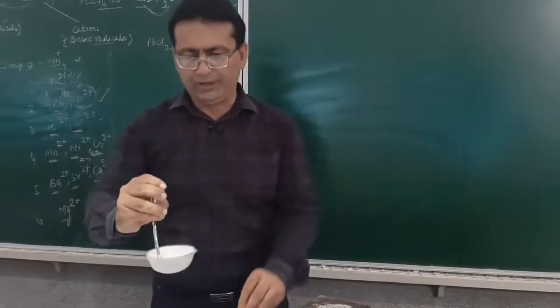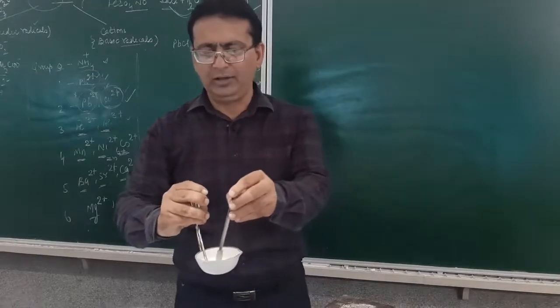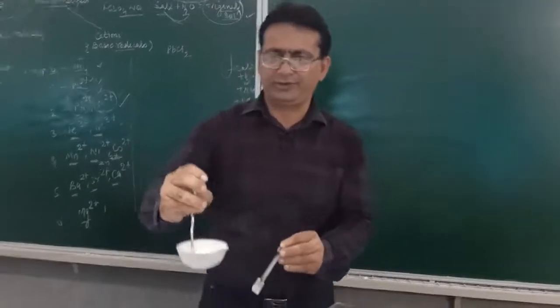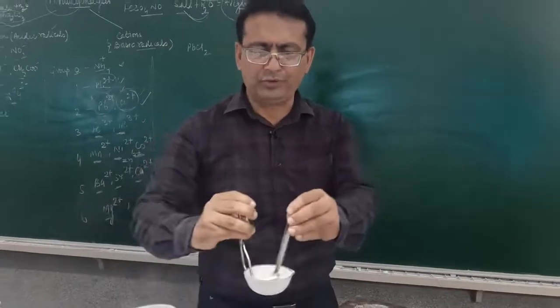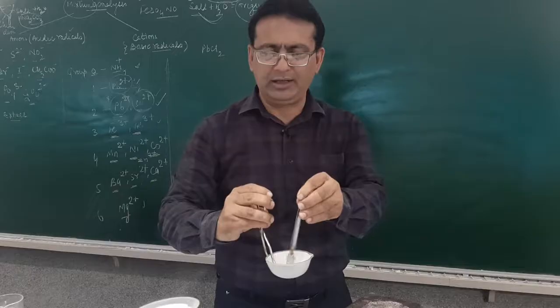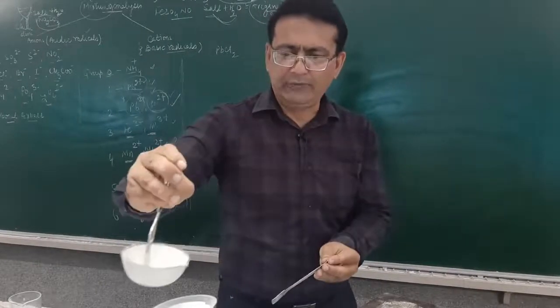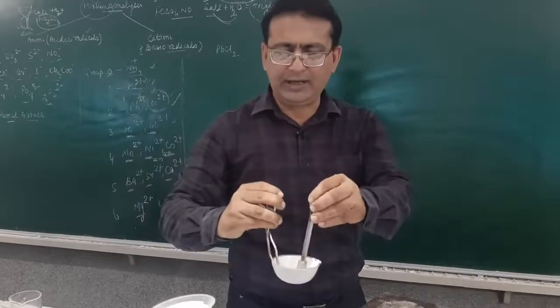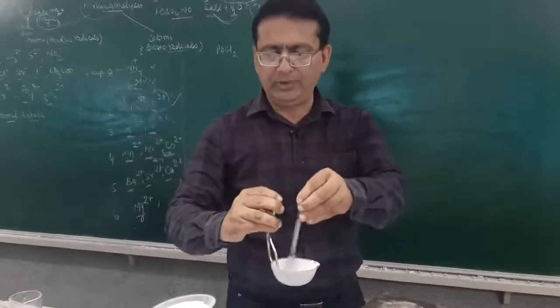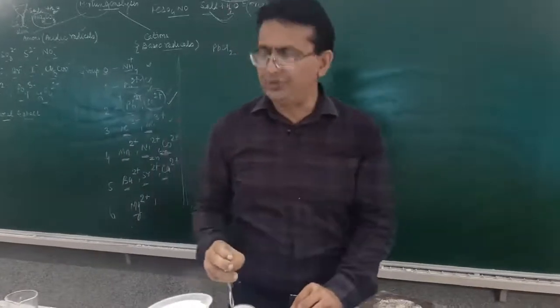You start filtering it. The filtrate so obtained will be called a sodium carbonate extract. Am I clear? It is in this filtrate that I will be carrying out the test, and the test of the anion will be carried out. Is it getting clear to you?